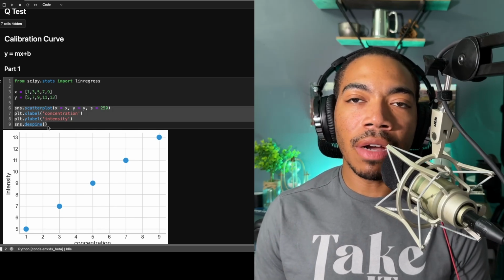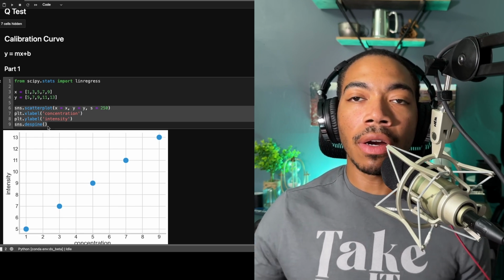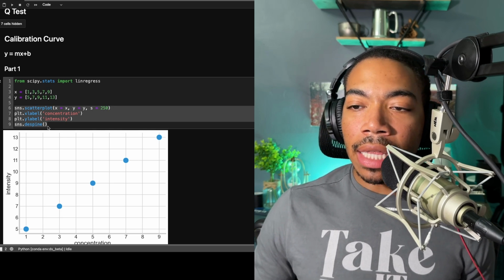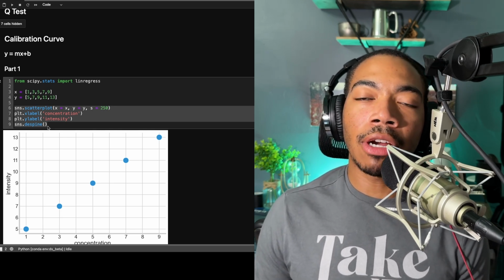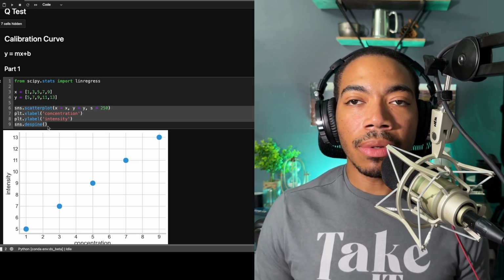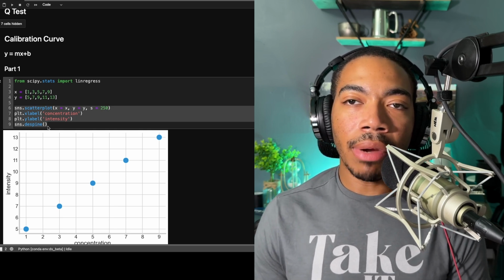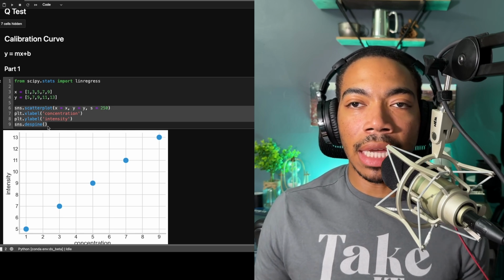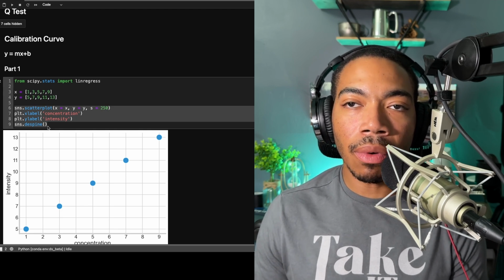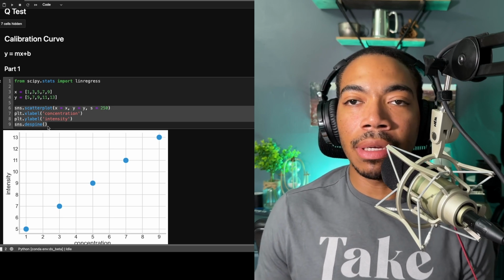In today's video, we will cover the second part of our two-part series on the calibration curve, which is part of our larger fundamentals of analytical chemistry series we're undertaking right now. And the goal of this video is to demonstrate how we can adapt our method that we built in the last video to build this calibration curve to either take in a new single value or a list of values. And practically this is important because oftentimes in the analytical context, you might have multiple samples that you now want to predict the concentration for from the same calibration curve. And so I want to demonstrate how we can add some flexibility to that method.